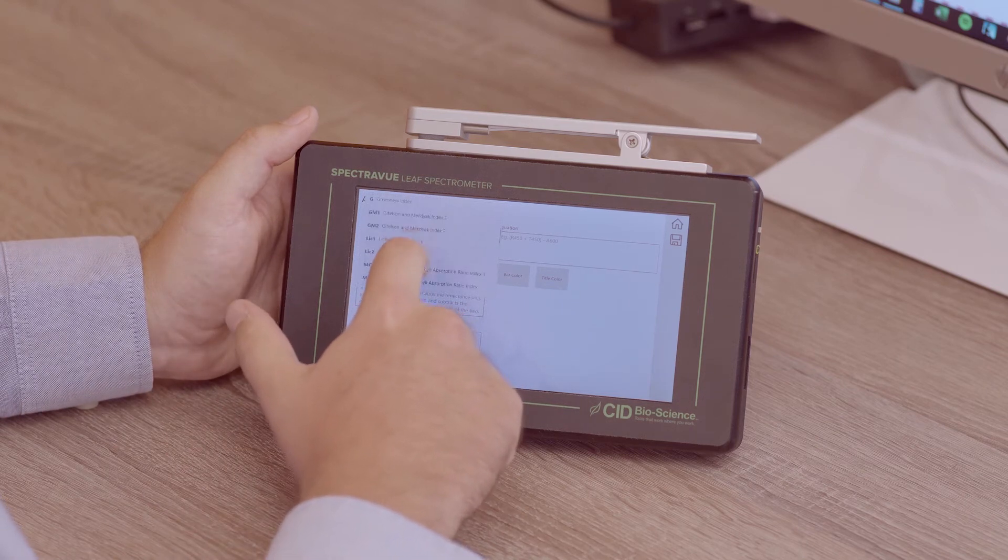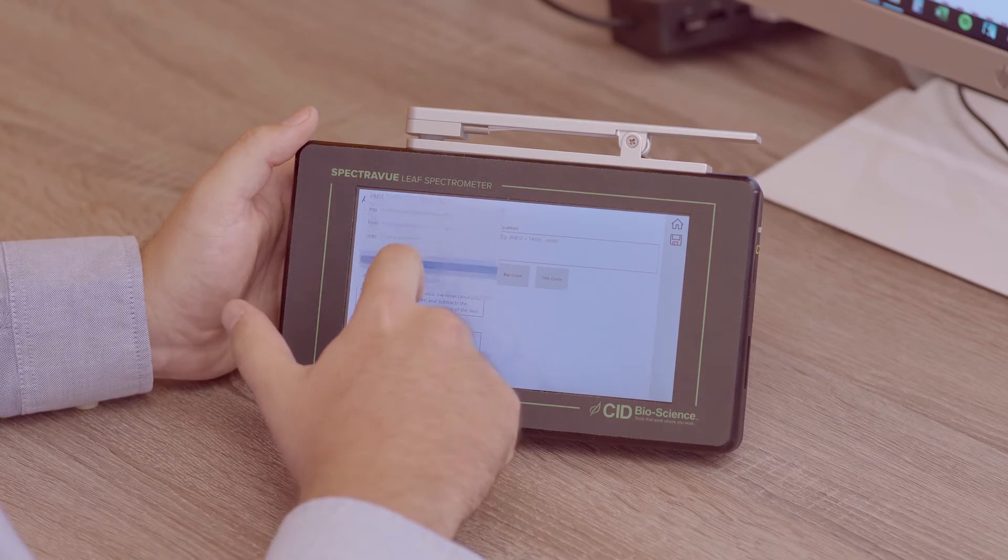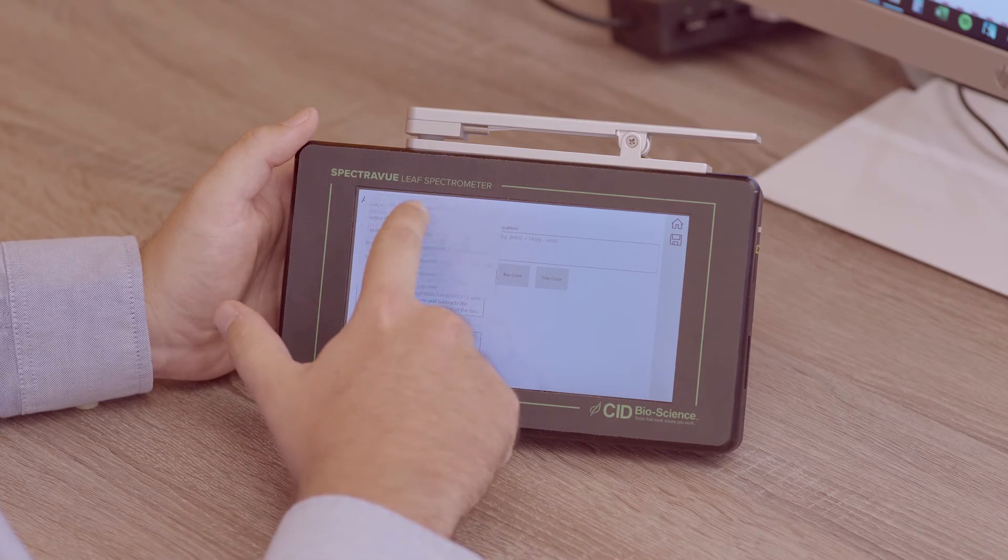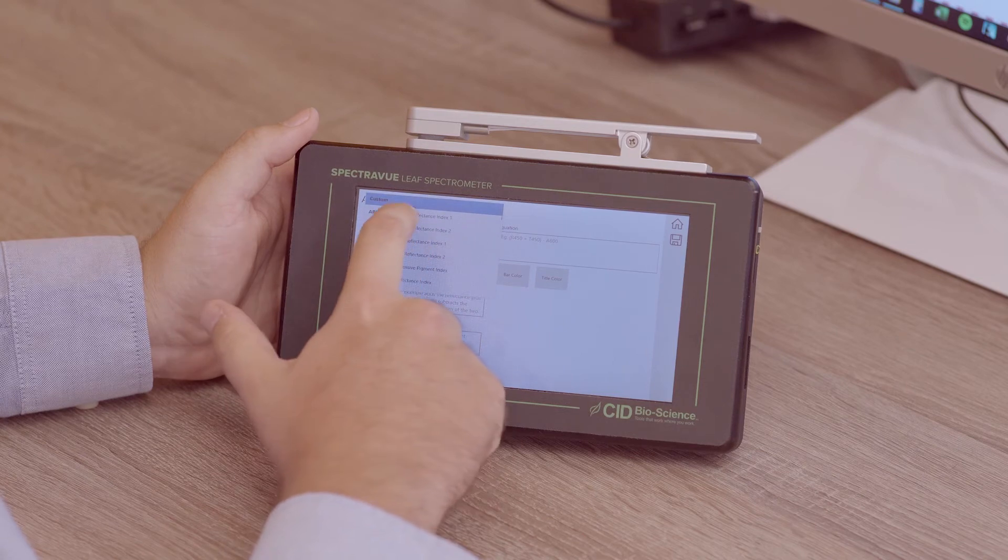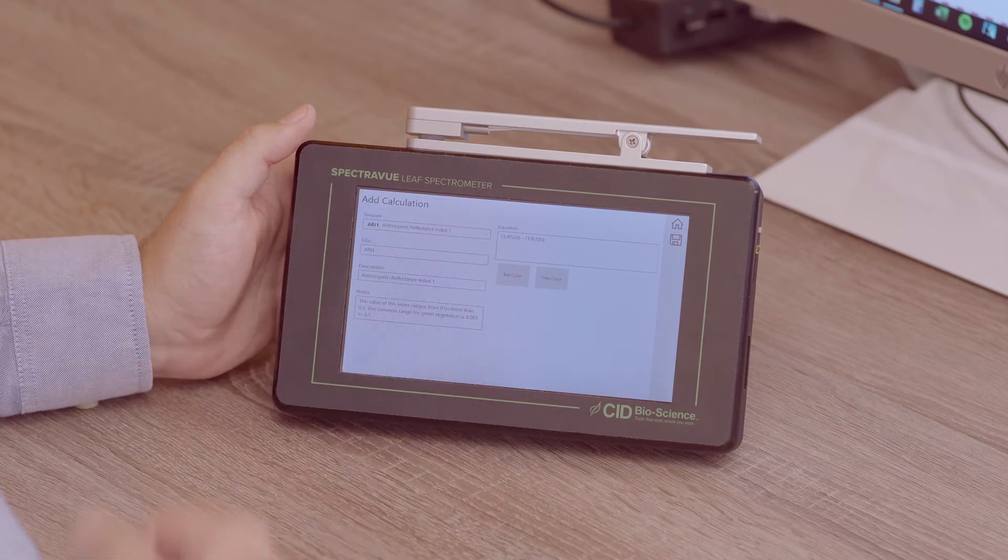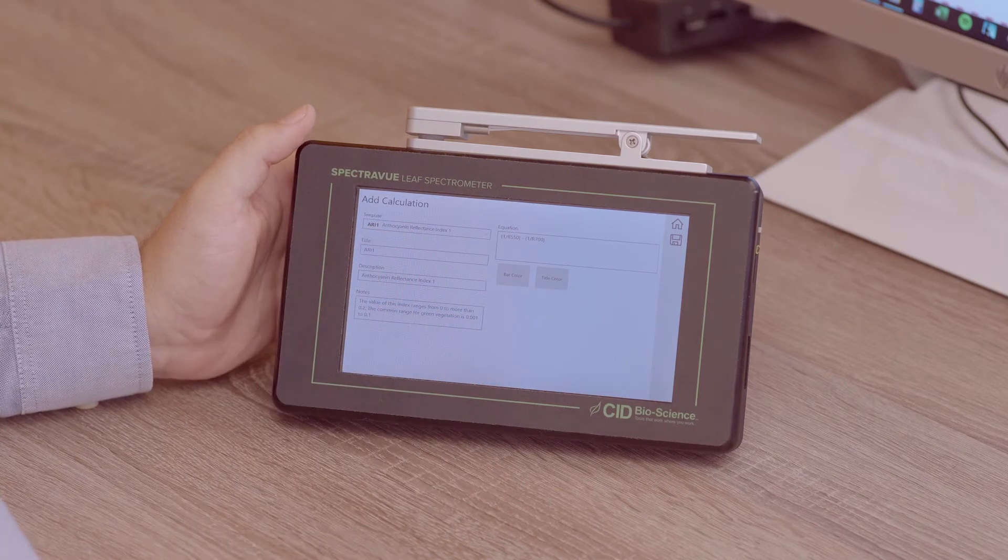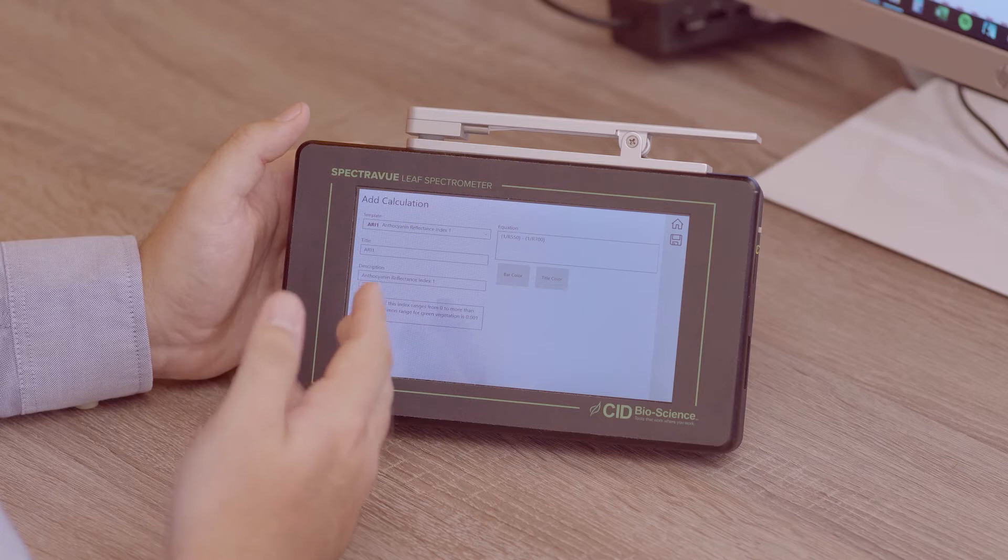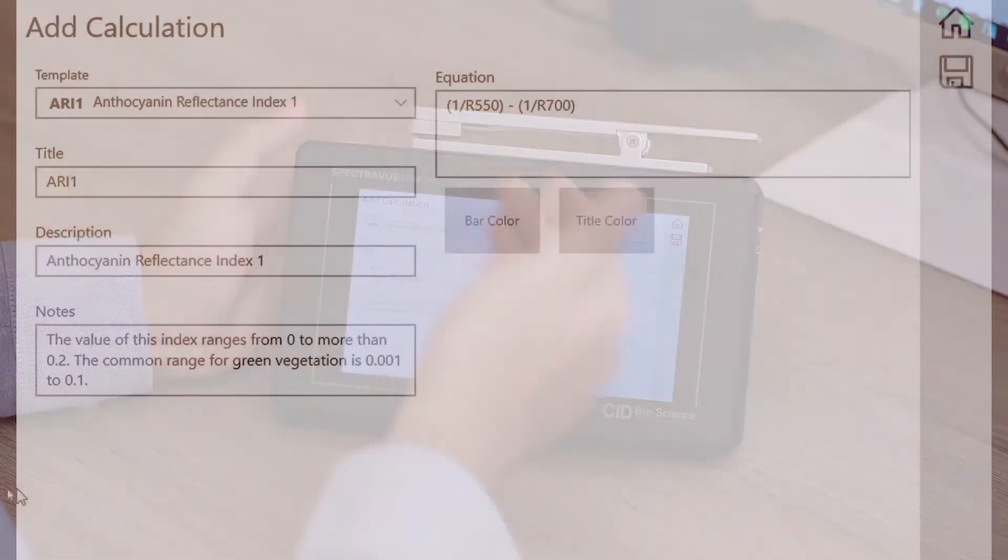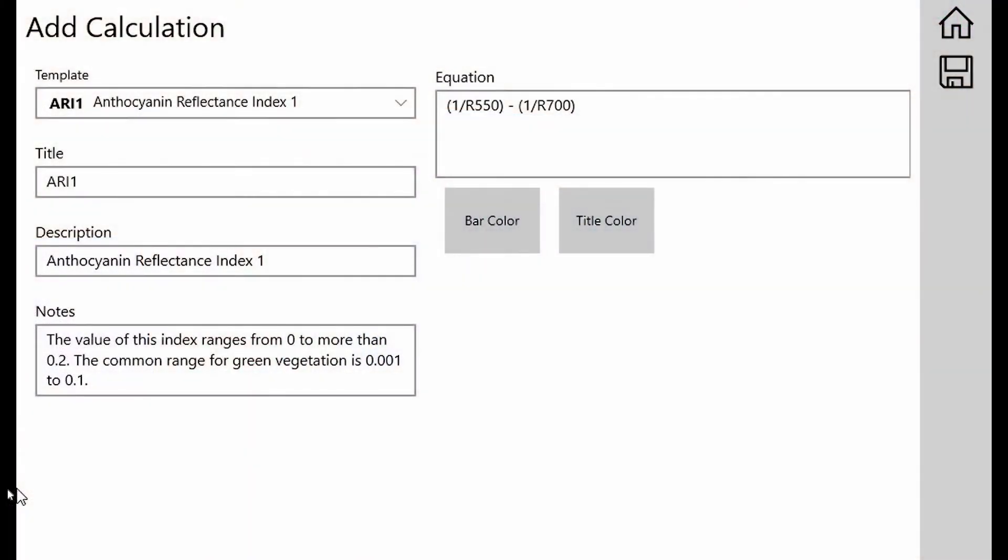So let's choose one for an example and load it. We'll start with anthocyanin reflectance index 1. When I click it to select it, you'll see that the screen here changes and the title now is reading ARI1, which stands for anthocyanin reflectance index 1. The description down here says what it is, which is just the title of the index itself.